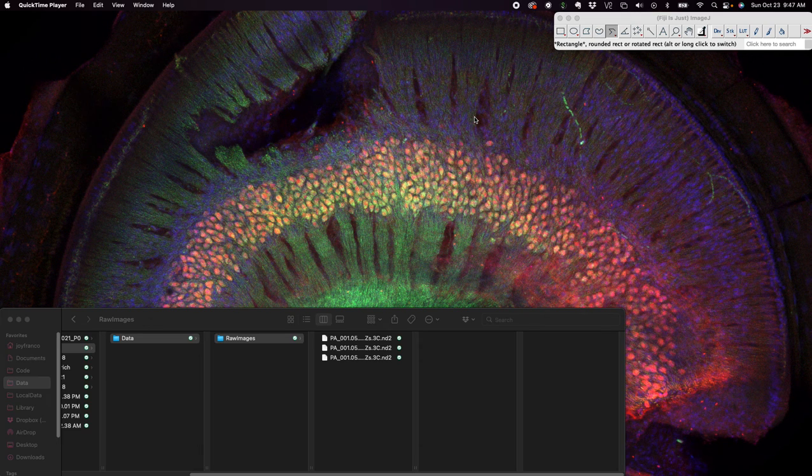Welcome to the first video on how to use NeuTrace 2.0. My name is Joy Franco, and I developed this macro. It's been a work in progress for a few years now. I started it in my dissertation research with Miriam Goodman at Stanford, and now I'm keeping it alive and adapting it as necessary for other purposes. So I'm going to walk you through how to use the code and what to expect from it.